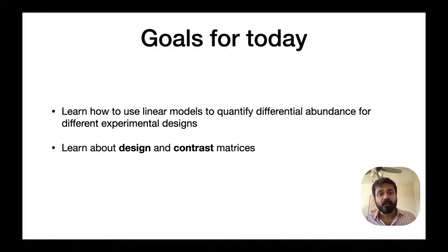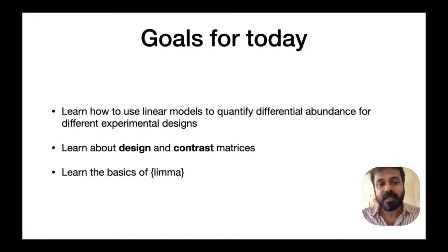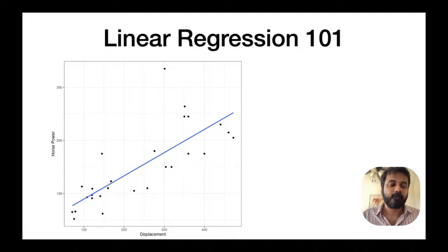We're going to learn about the concept of design and contrast matrices. And we'll also learn the basics of the limma package. And the limma package is what we'll use to perform this differential abundance analysis.